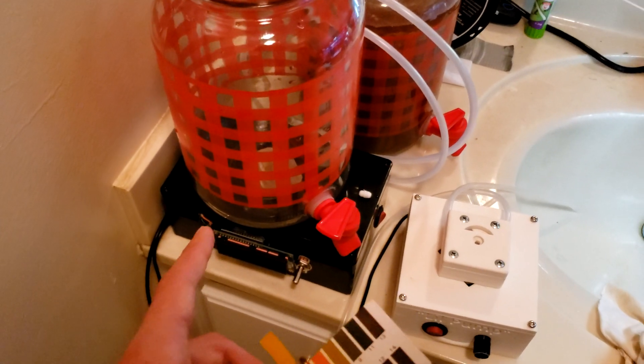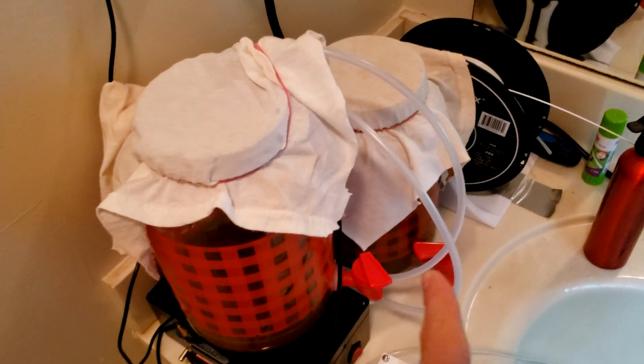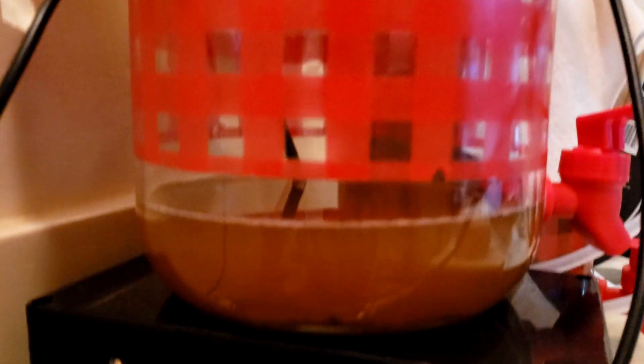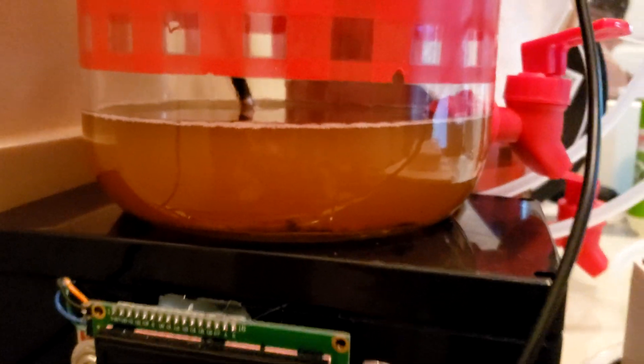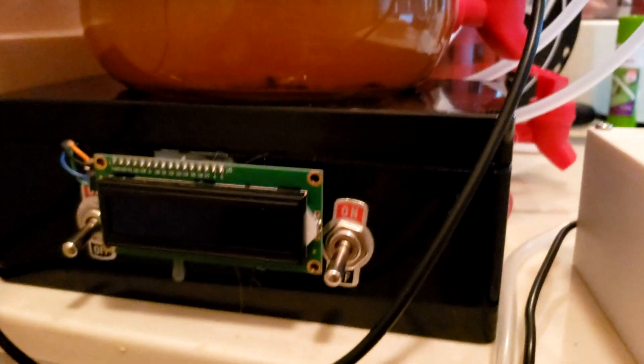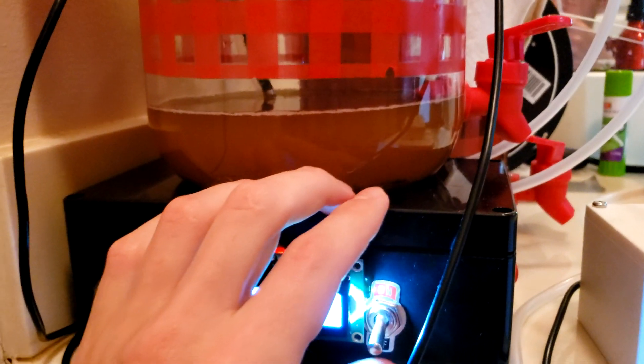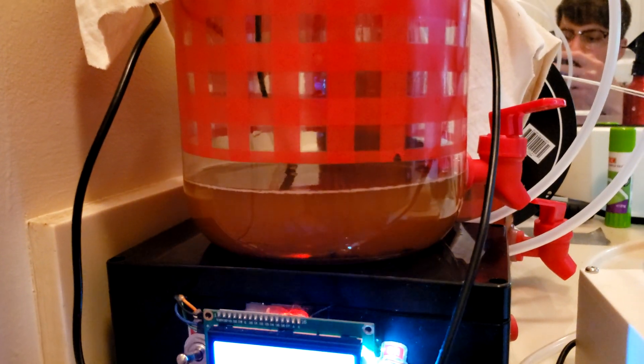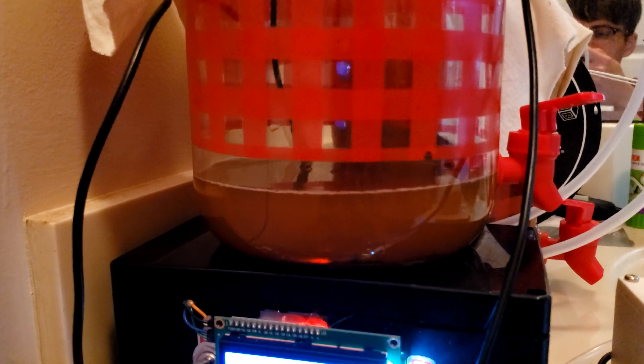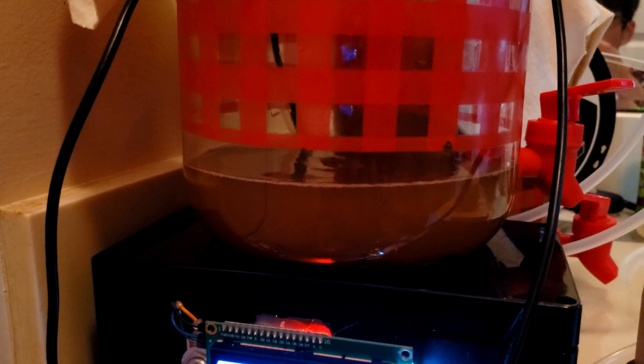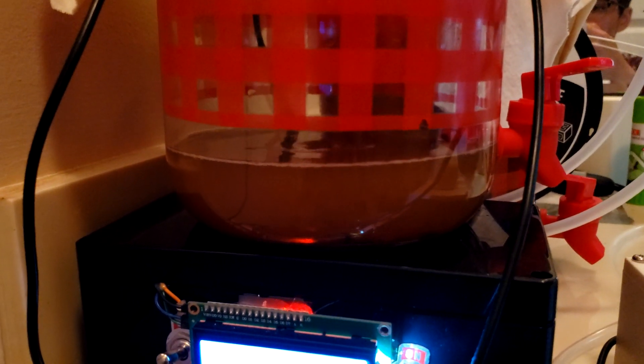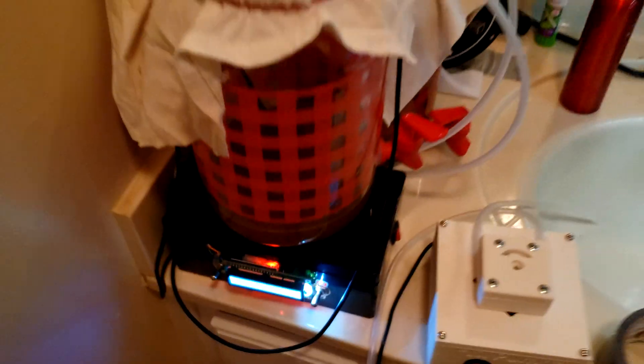Okay, now I'm going to set up the bioreactor. Okay, so it's all wrapped up just like the other one, except it's got a temperature probe and an air line. The air line is dangling in right there and the temperature probe goes all the way down. It's got a stir bar in there. So let's turn this guy on. Cool. So there's the temperature. We have our air buzzing through. And there's our stir bar going. You can really only hear it right now. There you go. You see the vortex going right there. Cool.